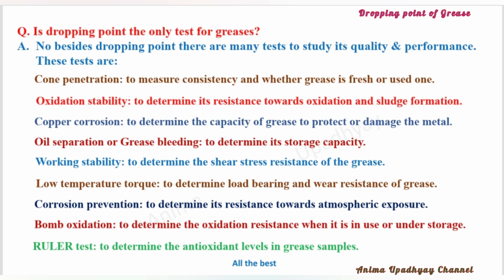Is dropping point the only test for greases? No. Besides dropping point, there are many tests to study its quality and performance, and these tests are cone penetration test to measure the consistency of the grease and also to see whether the grease is fresh or a used one. Oxidation stability.